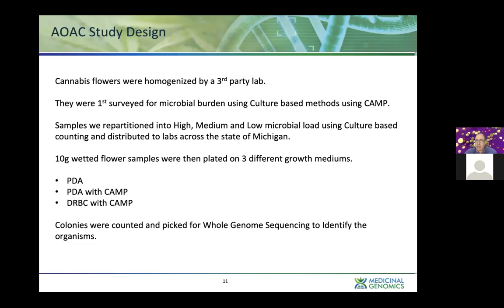So during this study, one interesting thing emerged is that we looked at what the 3 different culture mediums did, because many of the BAM chapters give you some latitude here. You can use PDA or DRBC. You're not locked in on one culture system, one antibiotic, and one growth time. You have latitude there, and that latitude we want to see what does it produce. We actually had trained our qPCR system on PDA, and so we were used to the correlation there. In came DRBC, which has more selection than PDA, and we got different numbers.